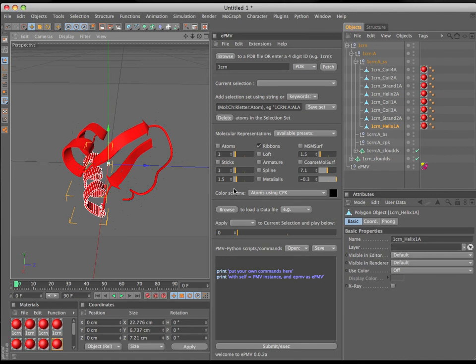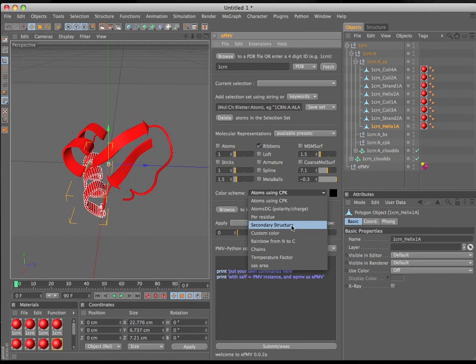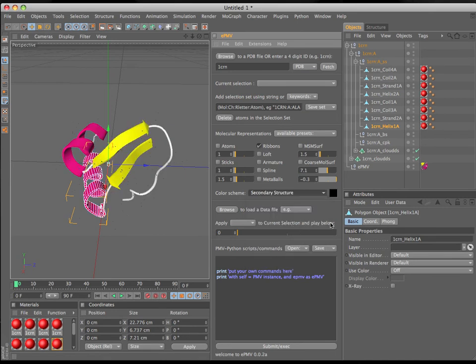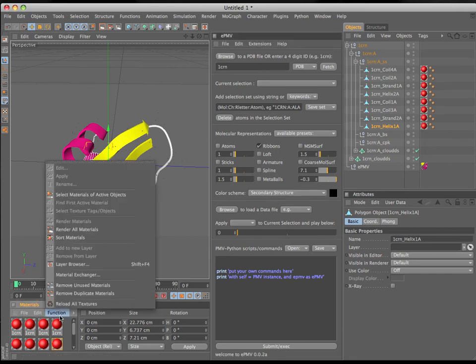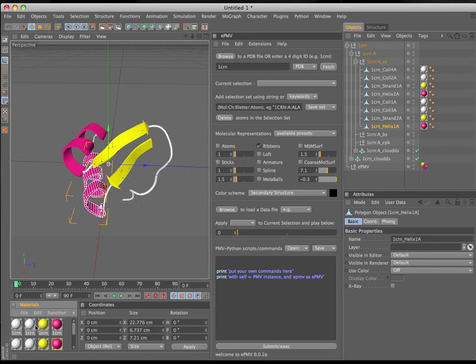Now, if we change the coloring scheme in the EPMV graphic user interface — for example, change color scheme from atoms using CPK to secondary structure — we've got a little bit of a bug down in the Materials Manager. I need to click File > Render All Materials, just to update what my materials look like in the Viewport, so that these are sensible representations of the texture tags applied with the materials in the Object Manager.